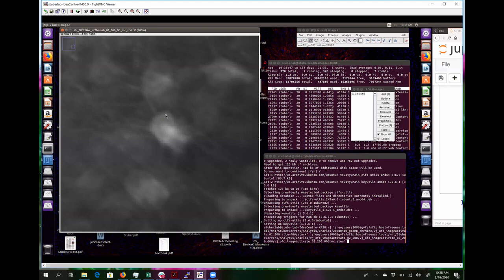I think I can do a little bit better, going around to the other side. I think I could probably go all the way here, but for now I'm pretty certain that everything in this region of interest is actually part of the cell. I think that's something that I would do too. So I'm pretty confident that that's part of the cell, and I'd use that as the ROI for the cell.